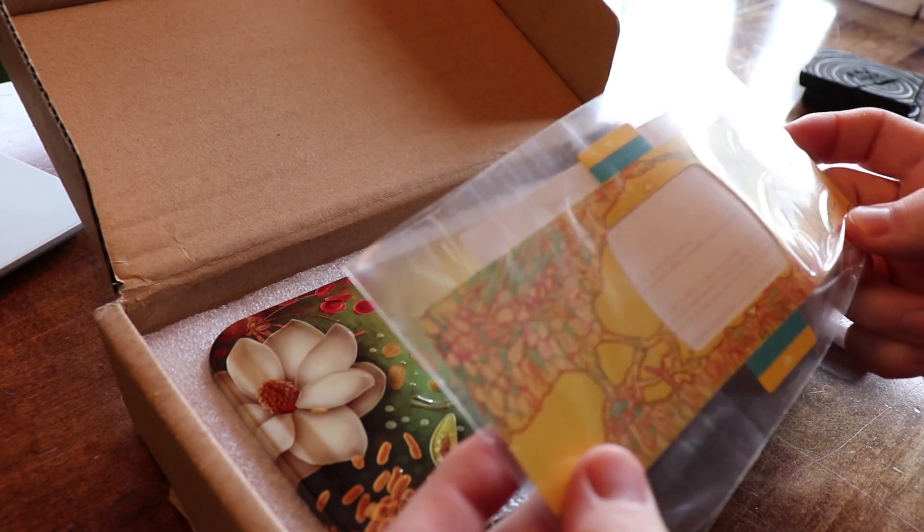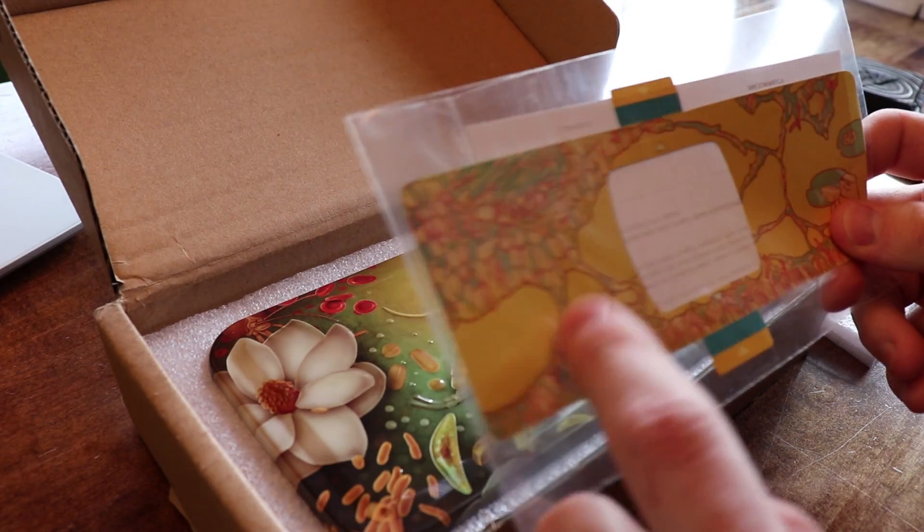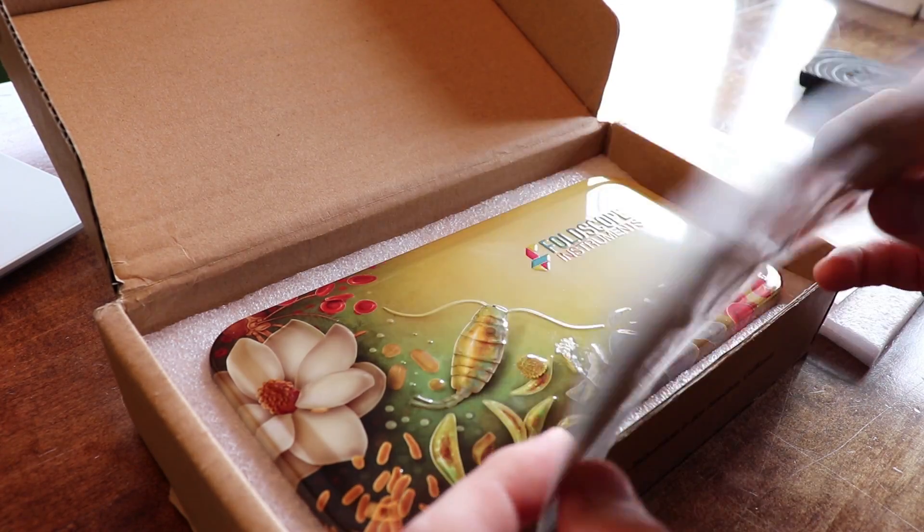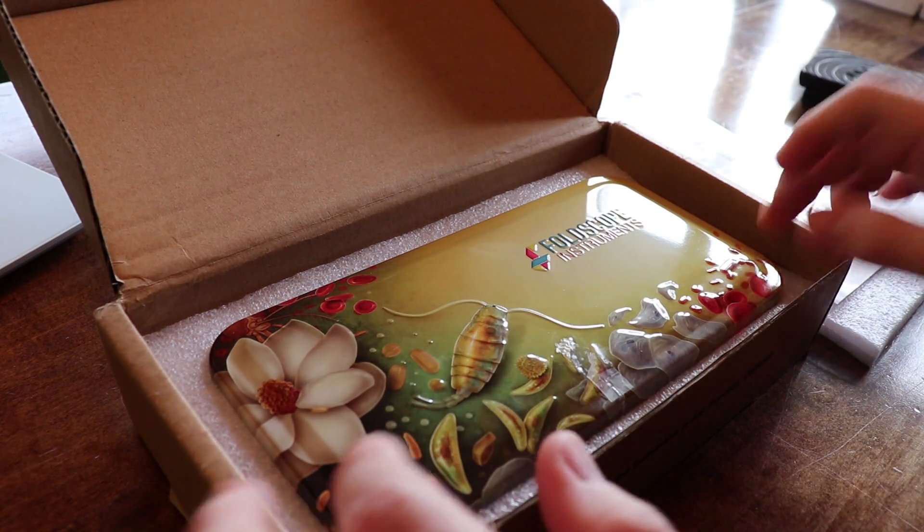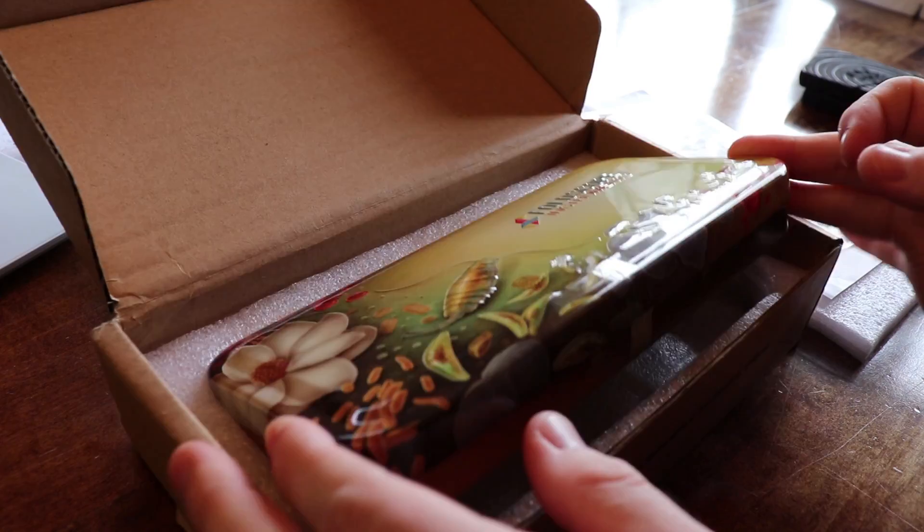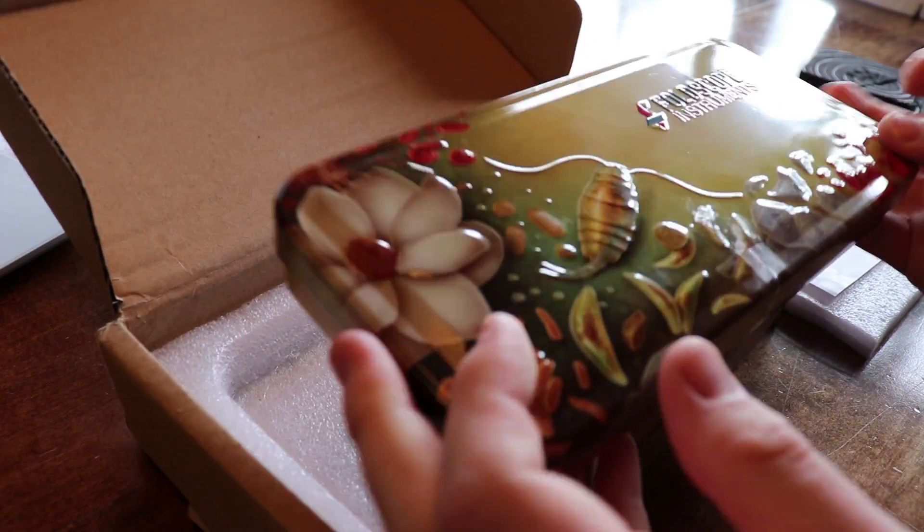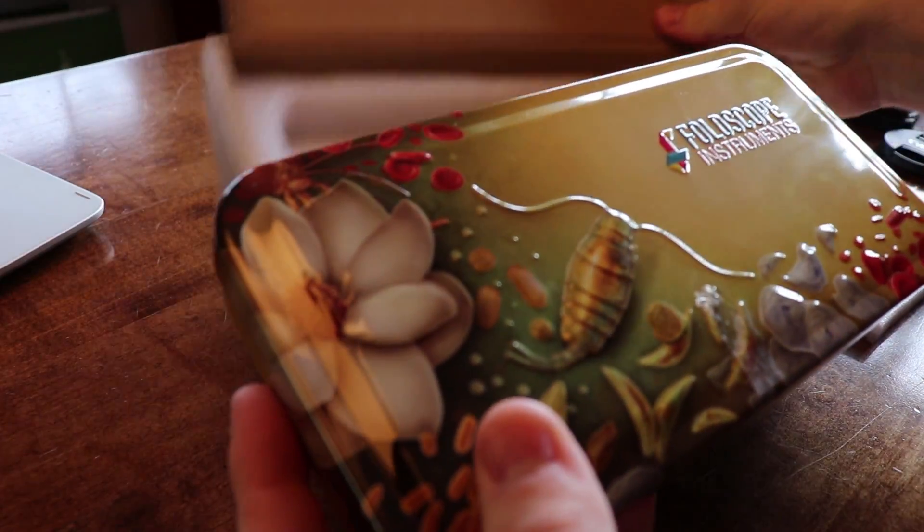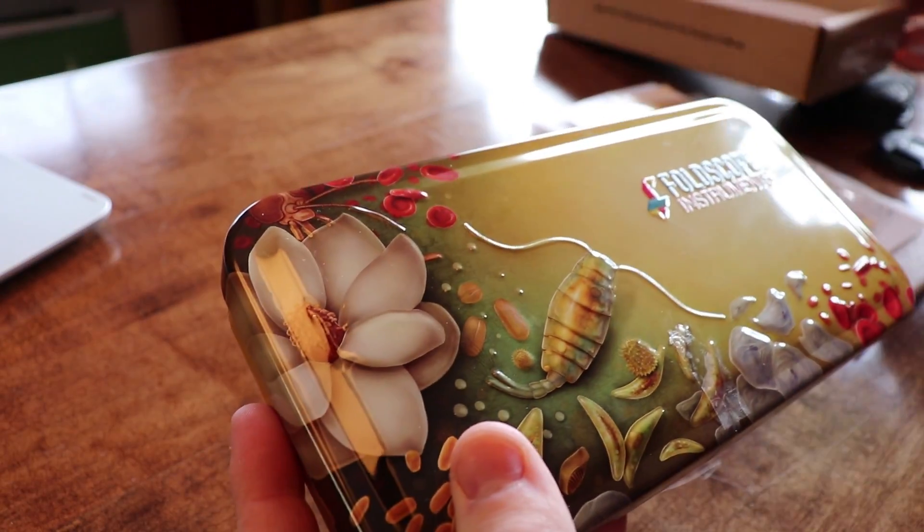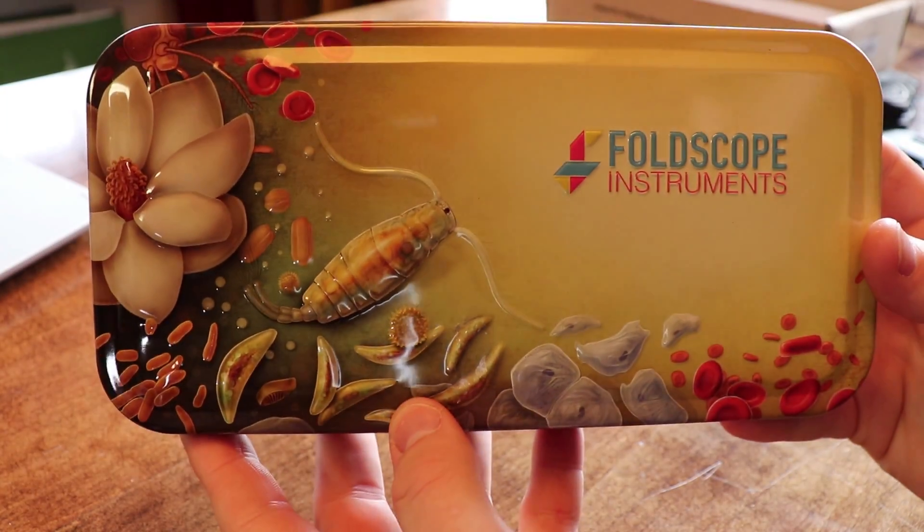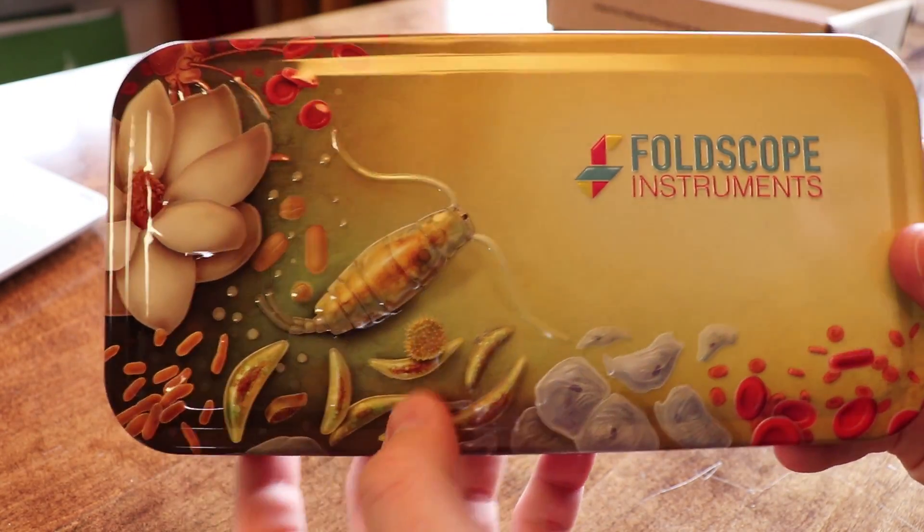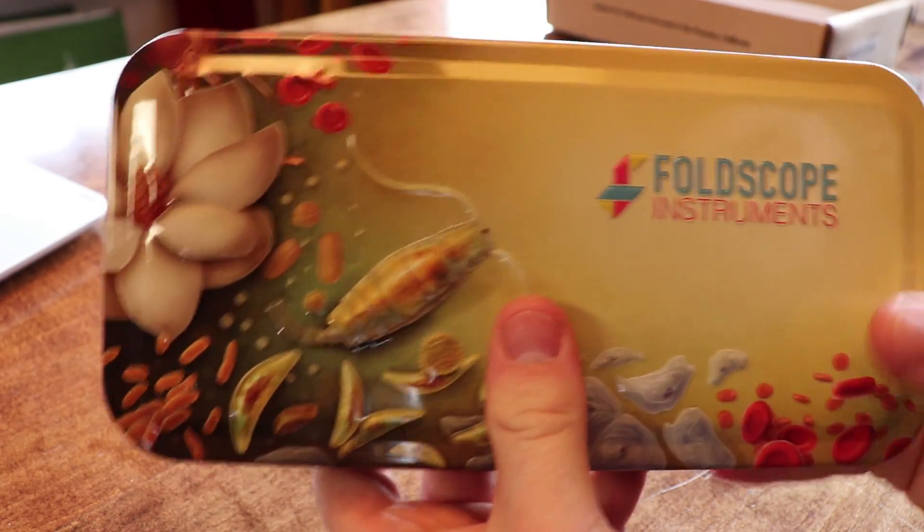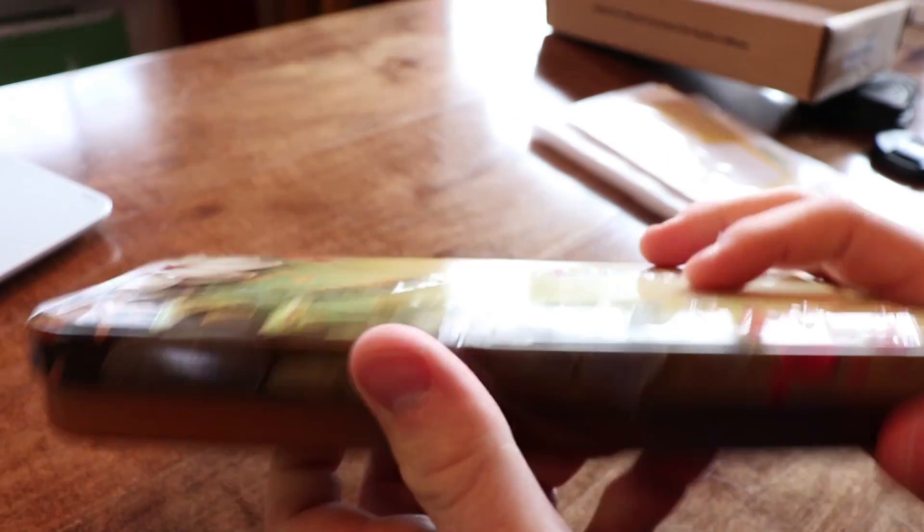But yeah, they're all paper. That's pretty cool. Alright, so let's open it up. This case is actually pretty cool. It's a nice metal little tin, little tin case.